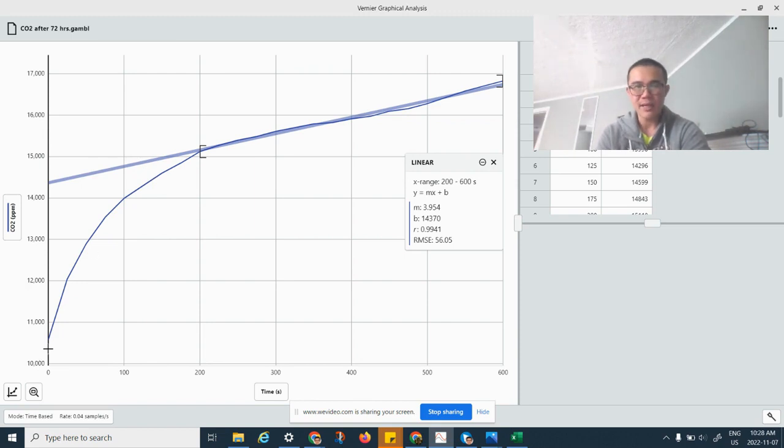And this is what happens today. As you can see, there's a quite dramatic climb up to about 3 minutes in. And then you see the CO2 concentration slowly, steadily goes up. We want to look for something like this in the data. We do want to look for a portion where there's a steady increase.